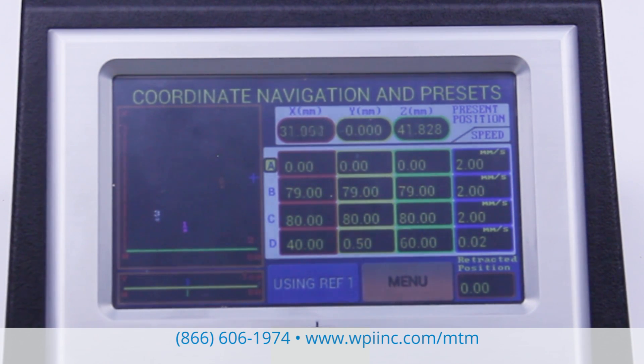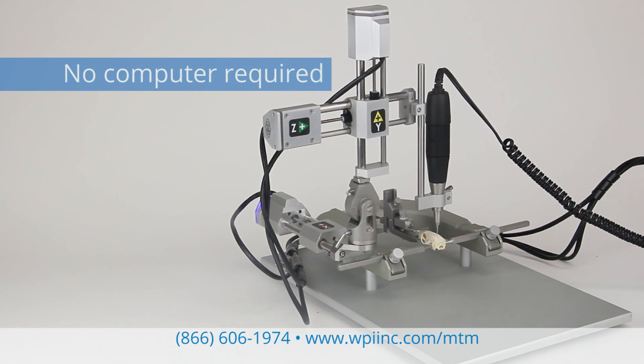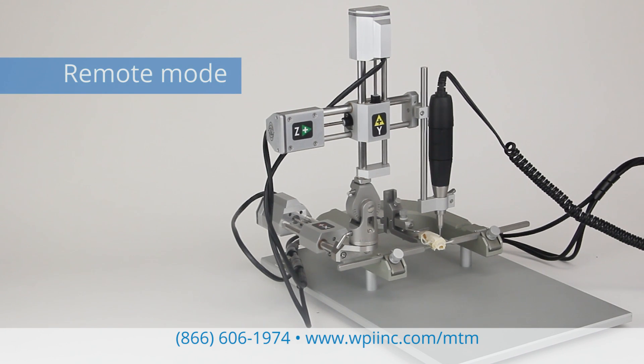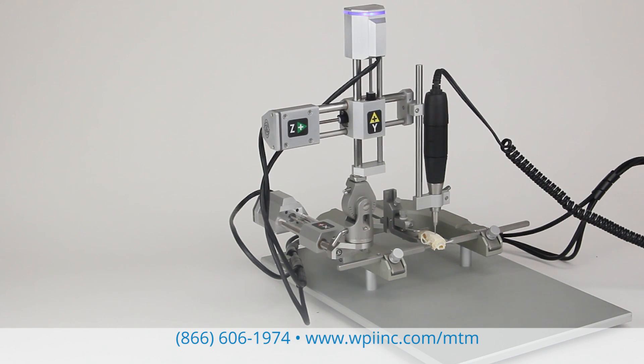The probe position may be displayed with respect to any of the references as well as absolute coordinates. All functions are accomplished without the use of a computer, although a computer interface is available if you prefer it. Using the text-based open command set and off-the-shelf communication software, you can create simple scripts for repetitive operations like drilling or injecting.